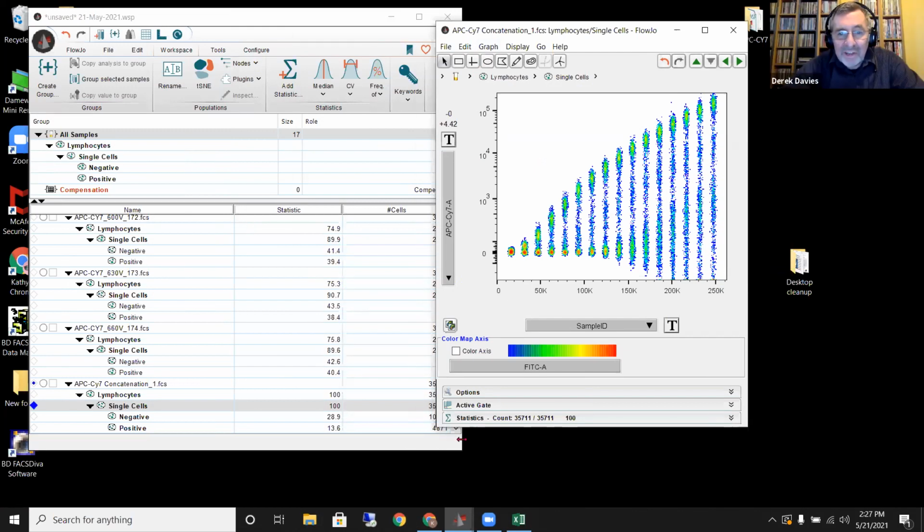Okay, so we have another question, Kathy, that we can probably both answer. Do you do these optimizations yourself for your users in the core? And if you don't, how compliant are people before they do their experiment? I'm sure we can both answer that one. That is a wonderful question. So I will say that it is a bit labor intensive because you have to do it depending on how many instruments that you have and depending on how many parameters there are. That's a lot of staining that you have to do.